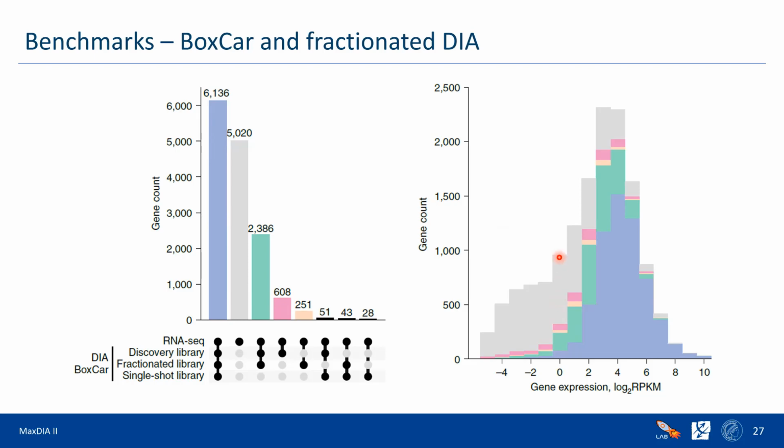And it's well known in the literature that RNA sequencing gene expression located below 0 values is actually transcription noise. These genes are barely expressed, and it's very questionable whether they were expressed at all. As we see, we also have very few proteomics evidences there, so it really supports the idea.